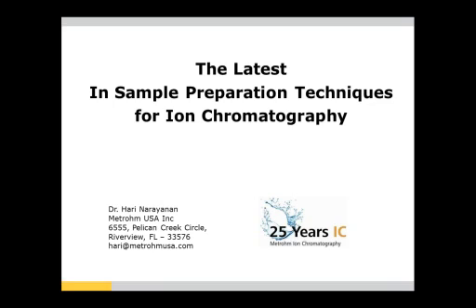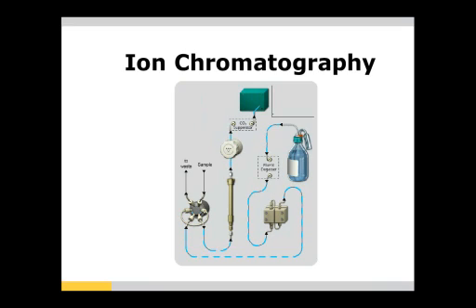Thank you, Dhanuja. So far we were listening about the organic molecule applications and the related sample preparation from Joni. I'm going to talk about the latest in sample preparation techniques to do with ion analysis. As we know, ion chromatography, which is part of the classification of HPLC, has grown and developed as a very important analytical technique for trace level ion analysis.